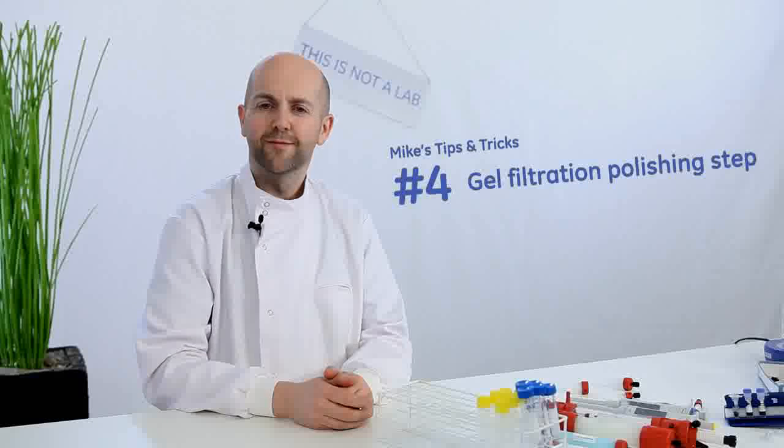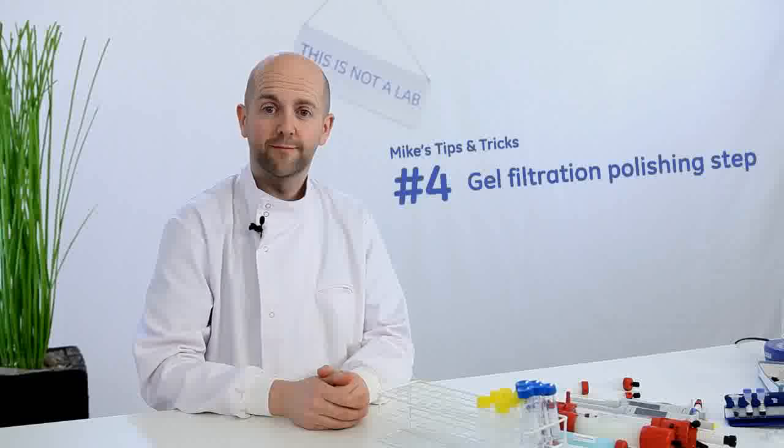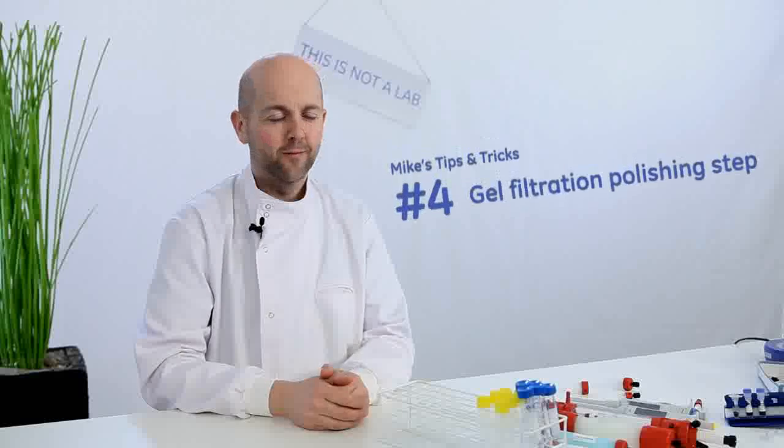Mike's tip number 4: when to use a gel filtration step to get optimal homogeneity. One-step purification with Protein A or G usually gives high-purity antibody. To improve homogeneity, you should think about using a gel filtration polishing step — for example, with a Superdex 200 column. This is really useful for separating monomers from dimers and removing large aggregates.